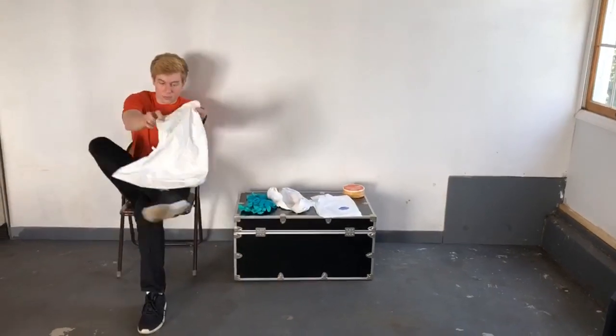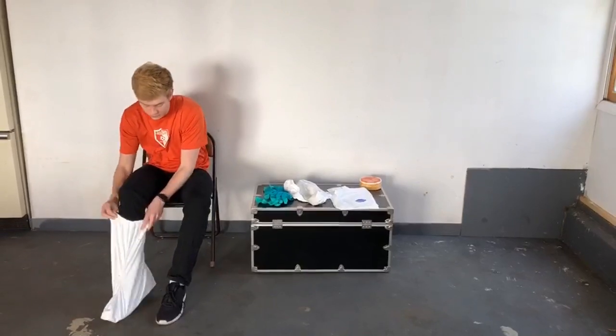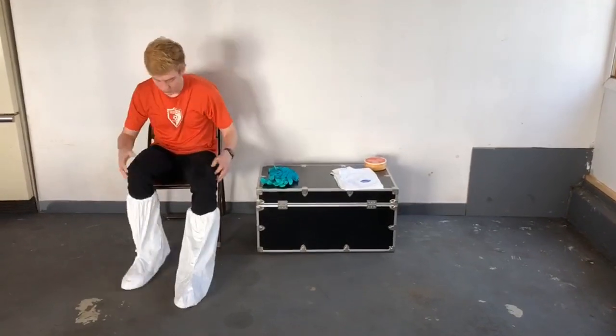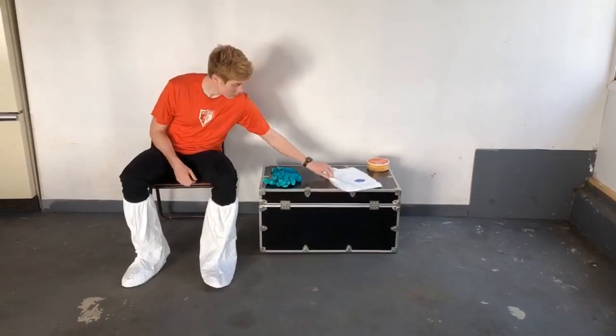The first thing Matt is going to do is put some sort of protective foot cover on. Anytime you're wearing a garment configuration because you're working with hazardous materials — whether it's chemical, biological, particulate, or whatever in nature — chances are you're going to be using some sort of protective foot cover. Once he's got the protective foot cover on, while he's still sitting, he's going to proceed.